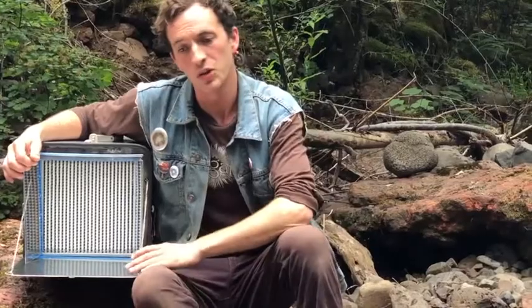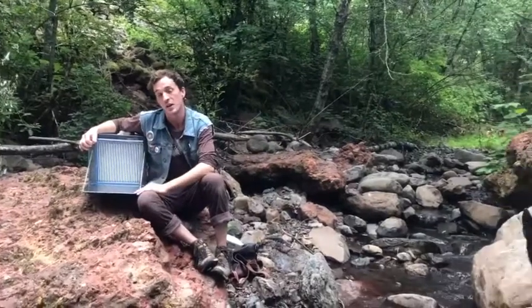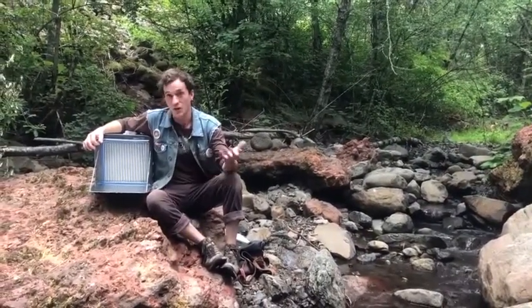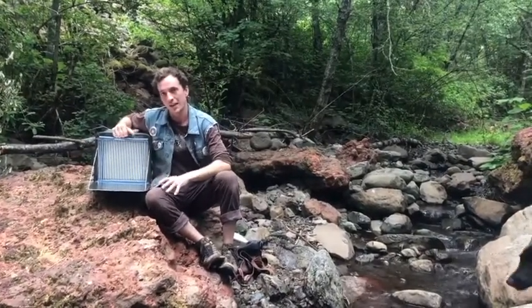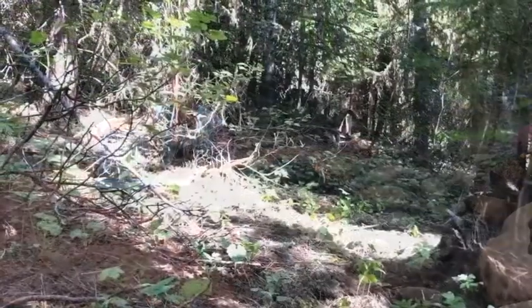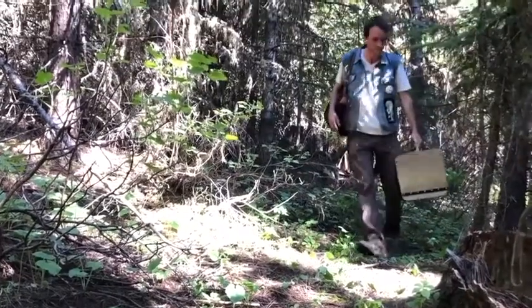I built this mainly because I was hoping to have a flow hood that I could use to conduct mycology and sterile tasks in the field. I wanted to be able to take it on the road with me, maybe take it to trade shows. And I realized I could actually make it small and light enough using lithium ion batteries to carry it into the woods, so I can actually clone mushrooms in the wild.